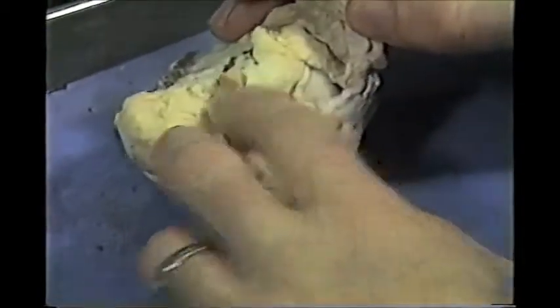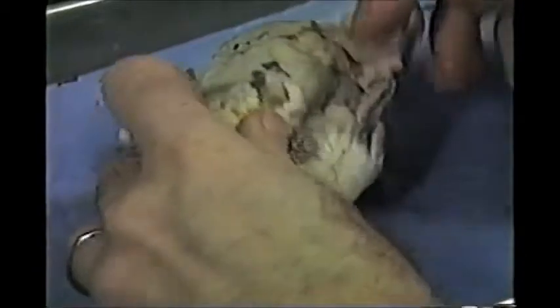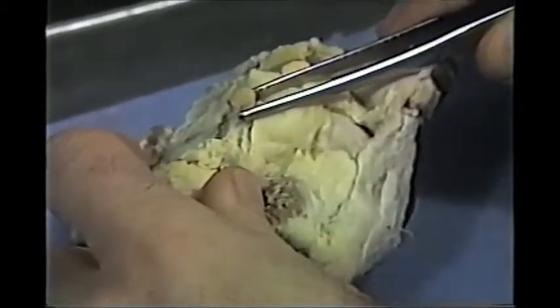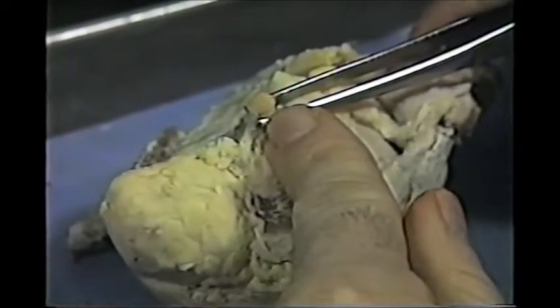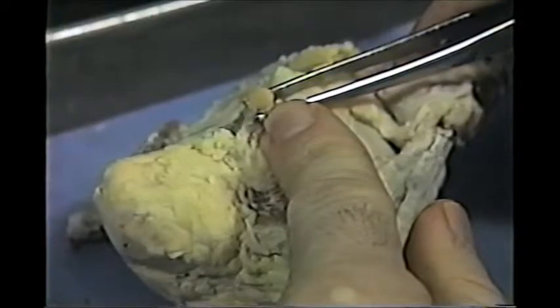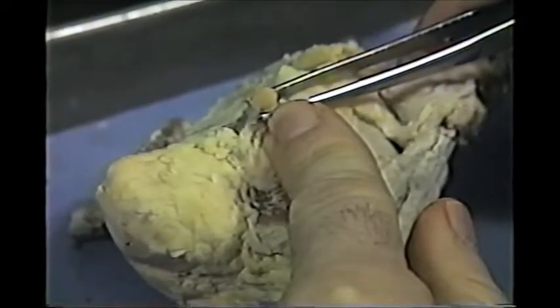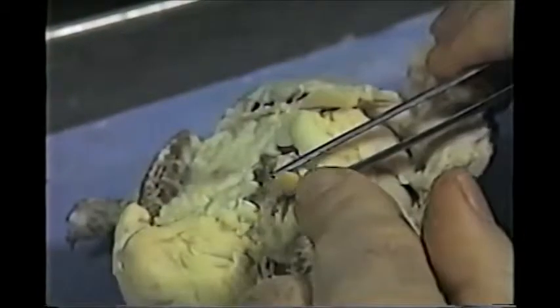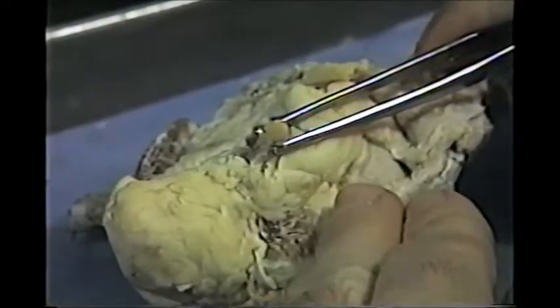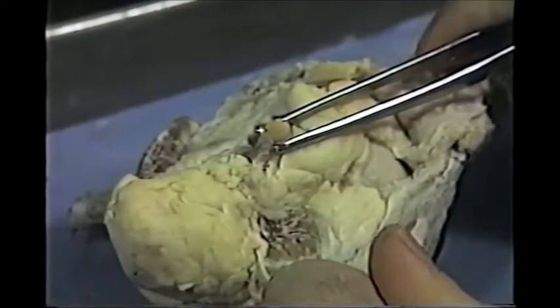Sticking out from the back of the eye, right here, we see the optic nerve. The optic nerves then would cross underneath the brain in the optic chiasma, which you learned when you did the sheep brain. The optic nerves carry the impulses from the back of the eye to the brain to be interpreted as sight.